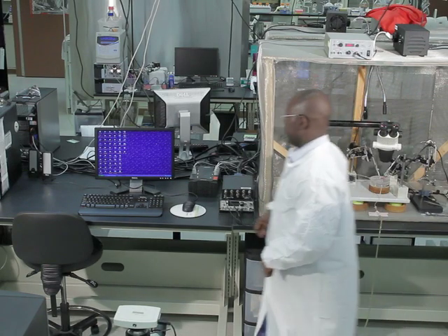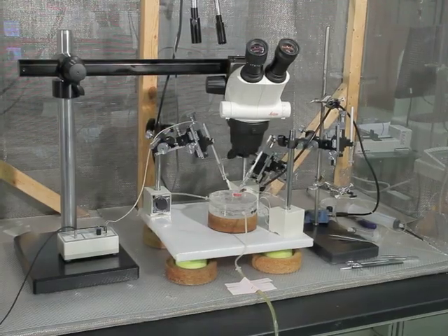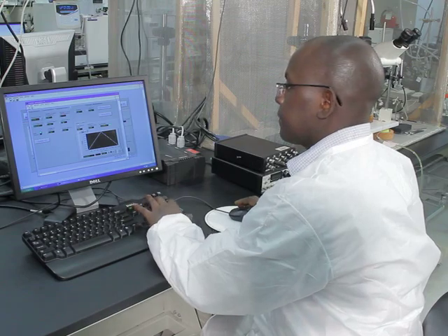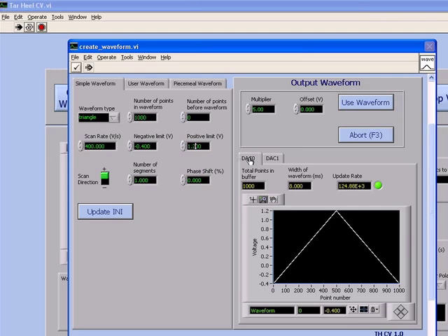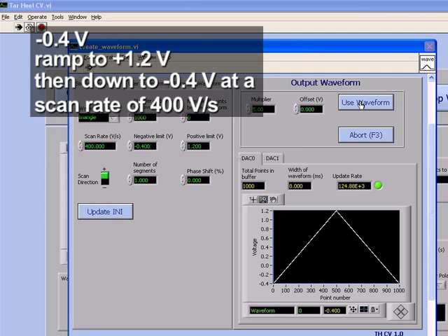The stimulating electrode will be used to deliver either a single pulse or multiple pulses of electric stimulations to the slice to evoke neurotransmitter release. To measure the electrically evoked dopamine using fast scan cyclic voltammetry (FSCV), apply voltage in a triangular waveform to the electrode. Hold the potential of the carbon fiber microelectrode at negative 0.4 volts, ramp it to a positive limit of 1.2 volts, then bring it back down to negative 0.4 volts at a scan rate of 400 volts per second.